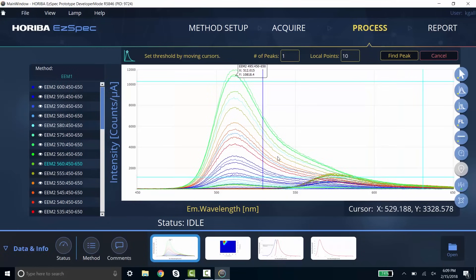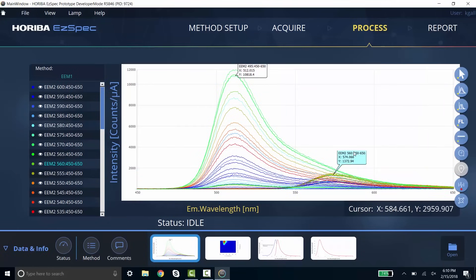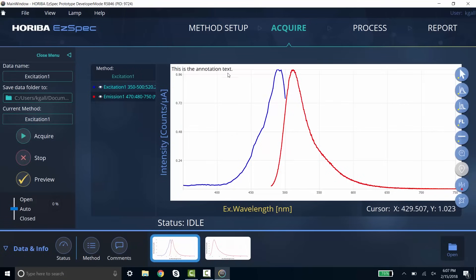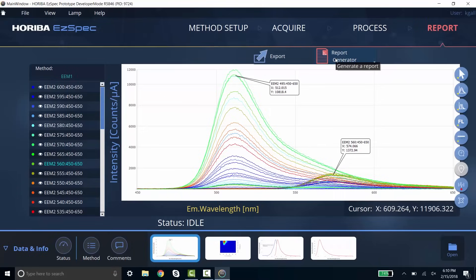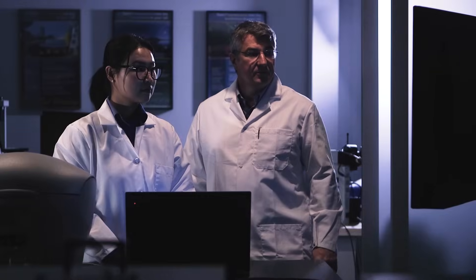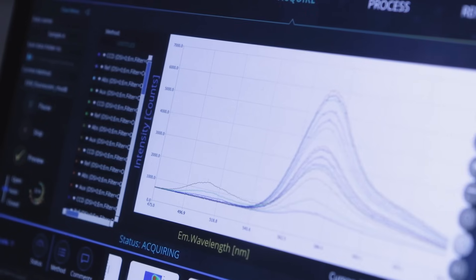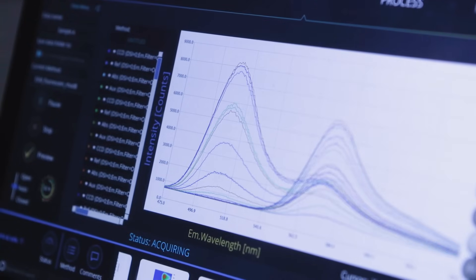With the full data processing suite, high quality graphics representing several data types, easy navigation and custom report generation, EasySpec's design will excite students and delight professionals.